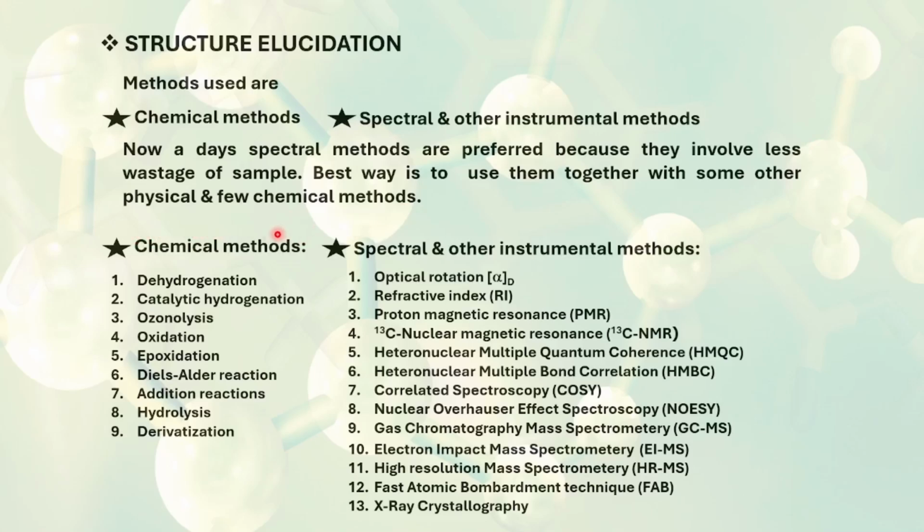In chemical methods, dehydrogenation, catalytic hydrogenation, ozonolysis, oxidation, epoxidation, addition reactions, hydrolysis, and derivatizations are included.